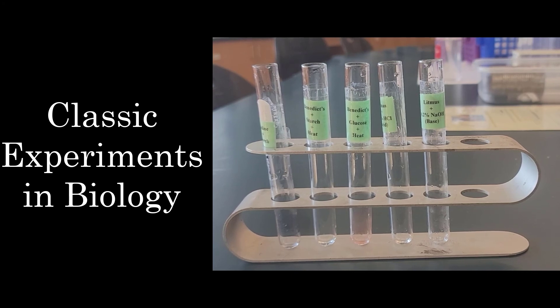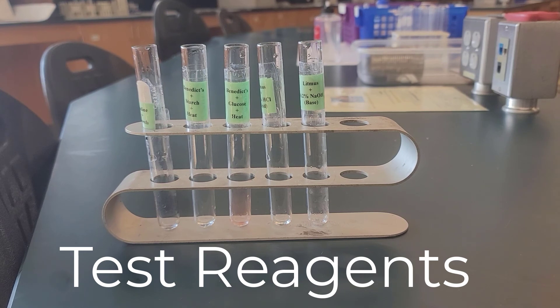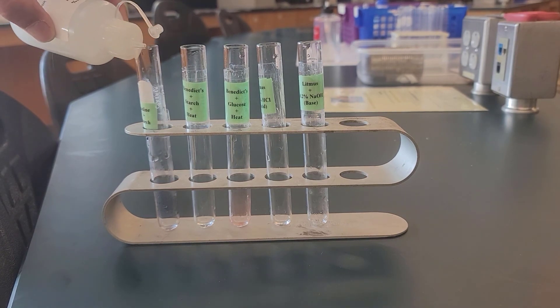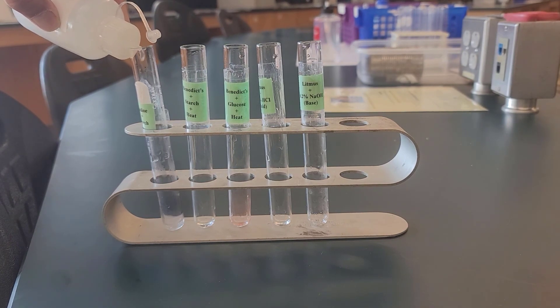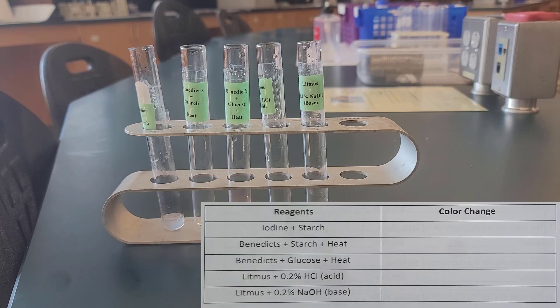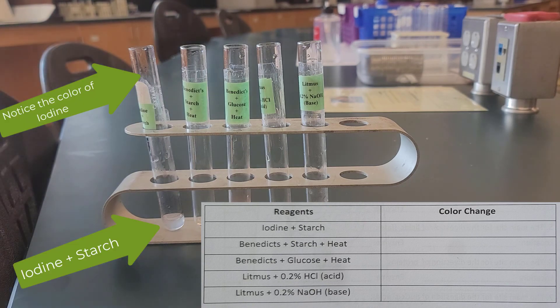Today, classic experiments in biology. In this first experiment, we're going to go over the test reagents. In test tube one, we're going to mix iodine and starch. You might find it helpful to have this chart handy so you can write down the color change, because that'll be helpful in other experiments. Note the color change.